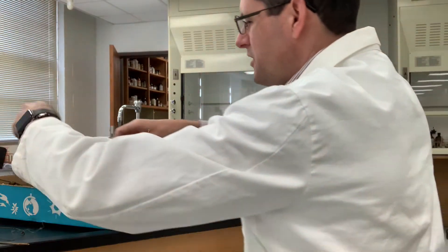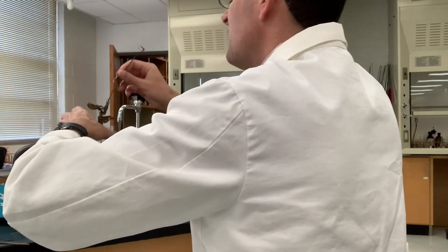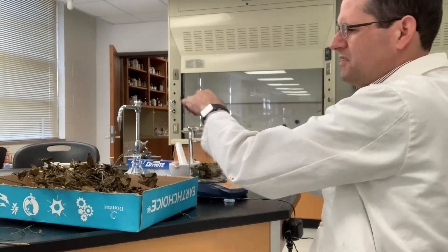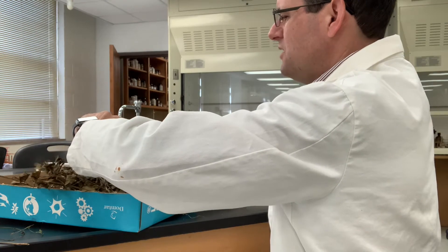Got like three grams so far. Just trying not to make a huge mess here.